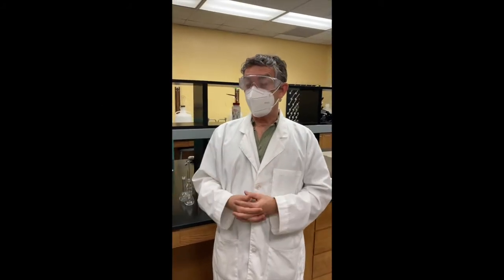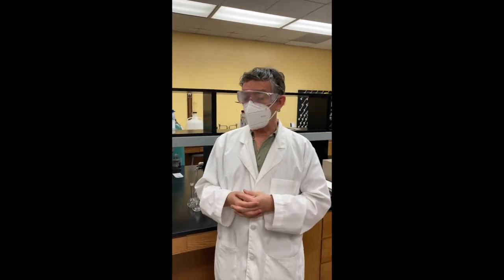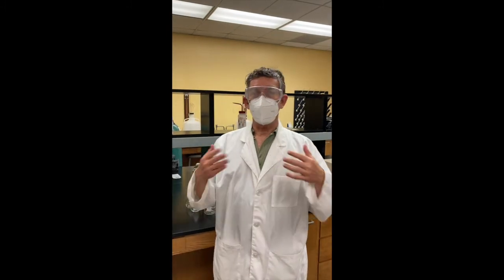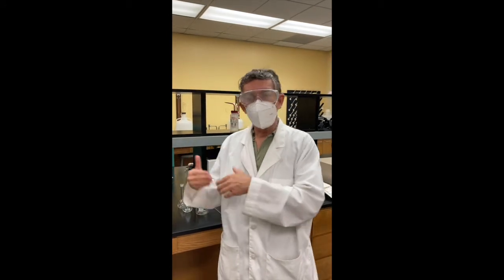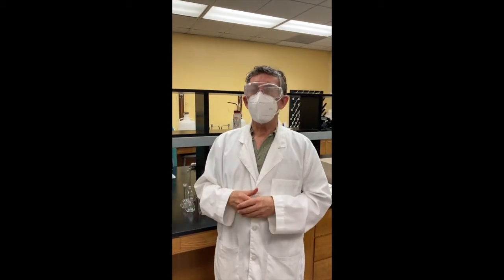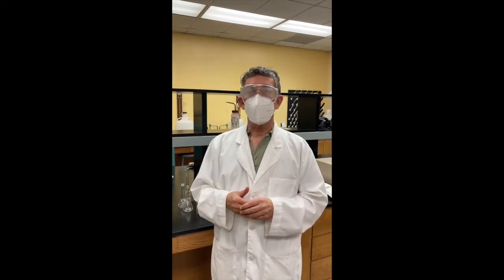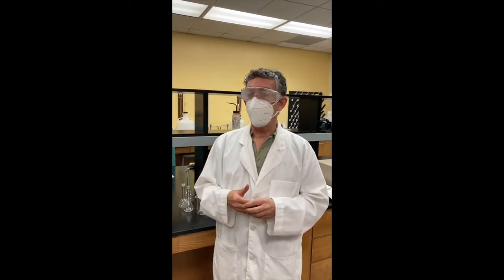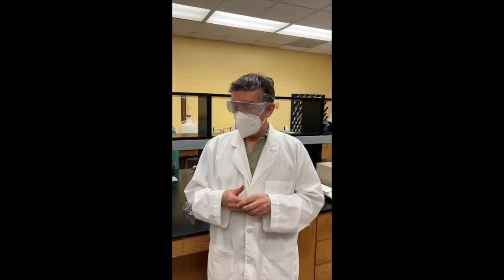So I want to tell you now about the process of carrying out this experiment, the viscosity and molecular weight of polyvinyl alcohol. You may have already seen the theoretical introduction, but just to frame what we're doing, we want to characterize a polymer. In this case, it's polyvinyl alcohol, and this is important because polymer chemistry is a major thing, important for industry, and characterizing polymers is an important thing for their properties, especially their physical properties.